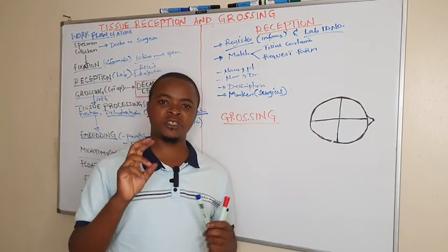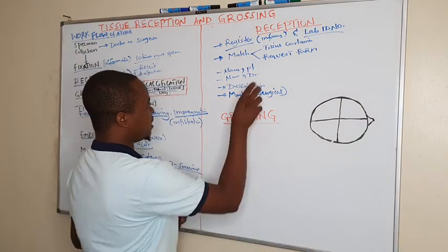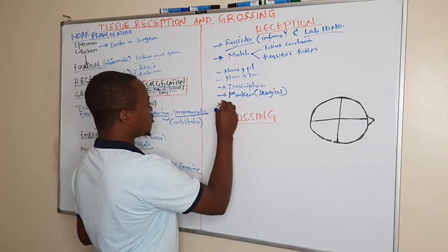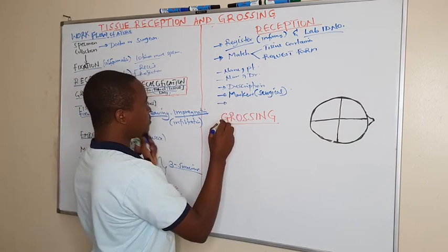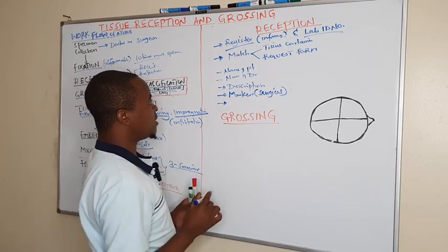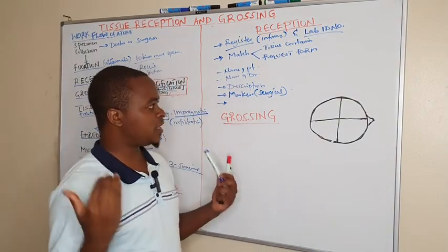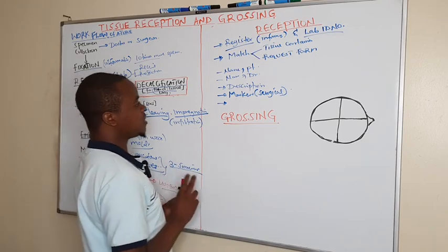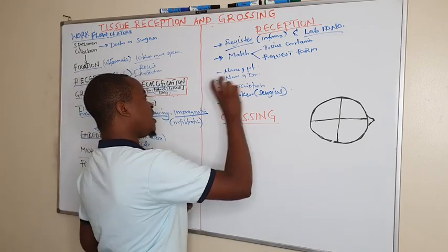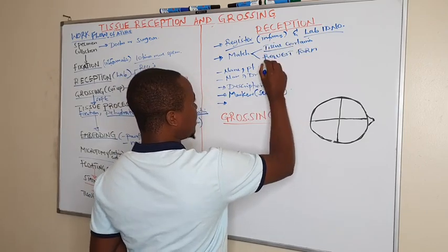Is it inferior position, posterior, and whatever. So look for the markers and the description. Under the description, that's where we find much of the information, what the doctor is suspecting and what he's interested in.